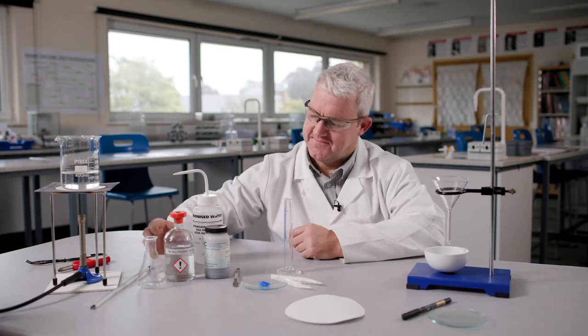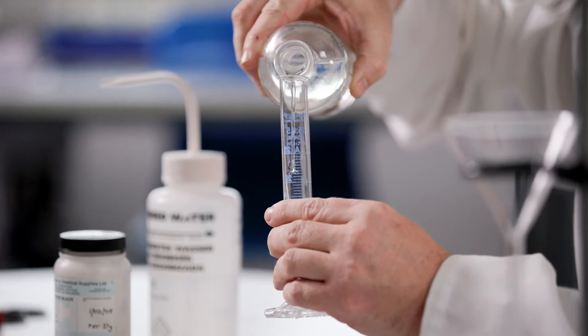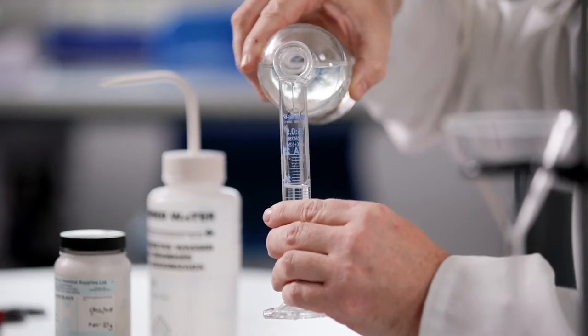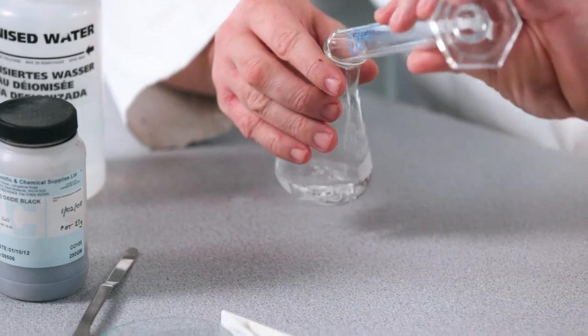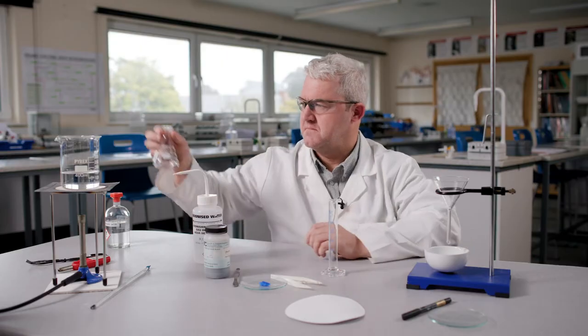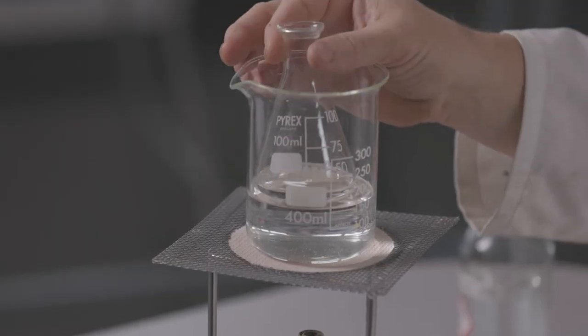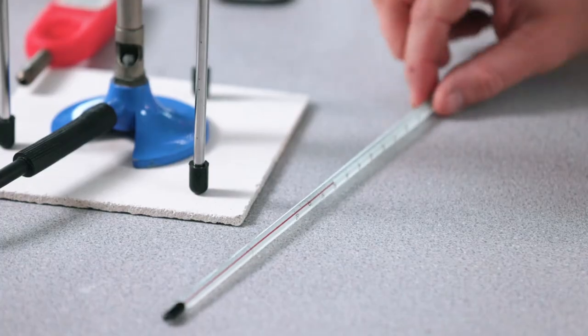To start off with, pour 20 centimetres cubed of 1 mole per decimetre cubed sulphuric acid into a measuring cylinder. Then add this to a 100 centimetre cubed conical flask. The reaction takes place faster at a high temperature, so place the conical flask in a bath of hot water at 50 degrees C.